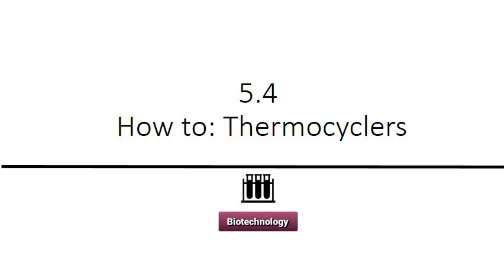Hey, this is Mr. Armand, and this is Section 4, Chapter 5 of PCR. Today we're going to talk about thermocyclers and what they are, what we use them for, all kinds of other crazy things.